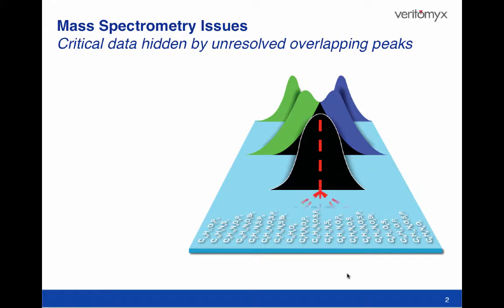One of the toughest challenges in mass spectral analysis arises when peaks are so close to each other that they are not resolved by the mass analyzer or software. By using PeakInvestigator software, you can effectively triple the resolution or more from your existing mass analyzer outputs.